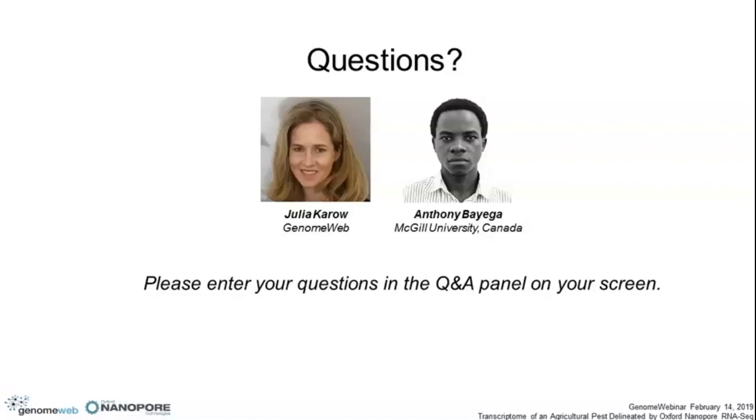Okay, thanks. Fairly general question: what sample quality control steps did you use in your experiments? Sample quality control. So we use tools that are available to do QC. We use the aligning QC mainly to see how many reads are chimeric.